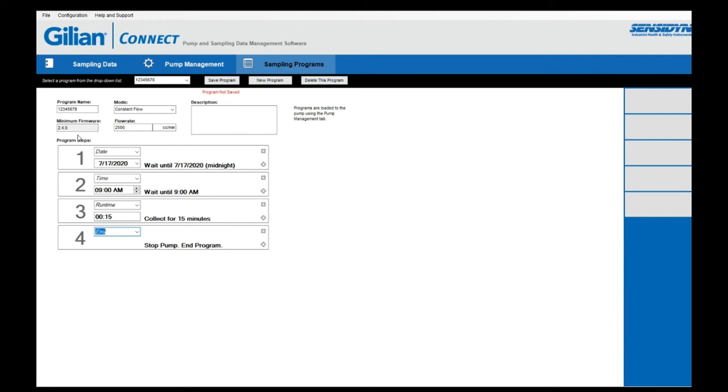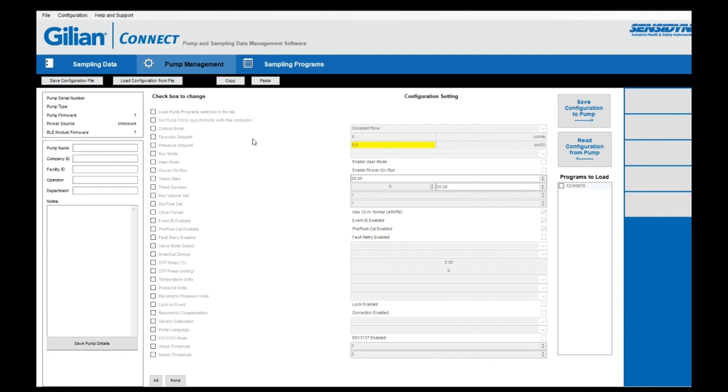Once you have this program saved, you'll see the program name and you will want to save the program. To load this program into your pump, place your pump on the docking station. The pump will sync with your Gillian Connect PC software and the serial number of the pump will appear in the right-hand column of the screen. Go into the pump management program, which allows you to configure your specific sampling pump. Select the pump you wish to load the program to, then select the program you wish to load. Check the first box and go to the program list to select the program we just created.